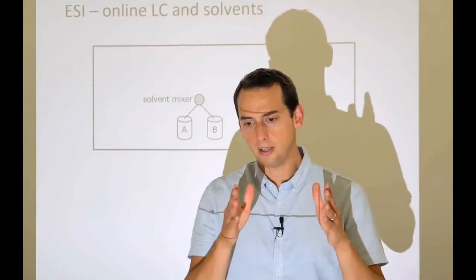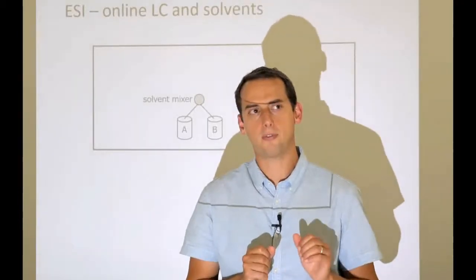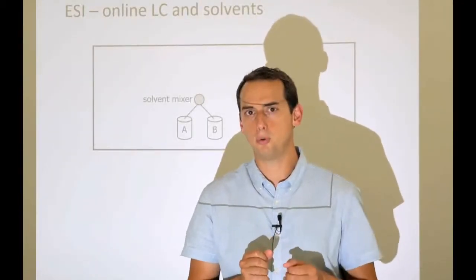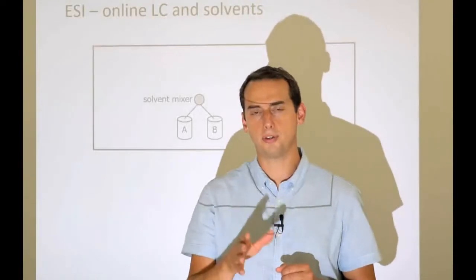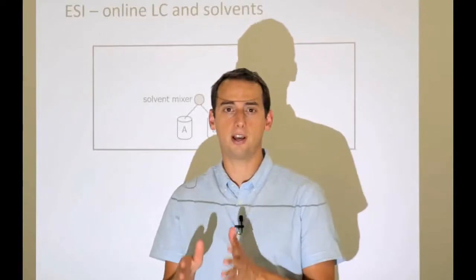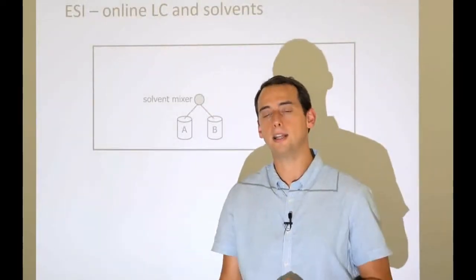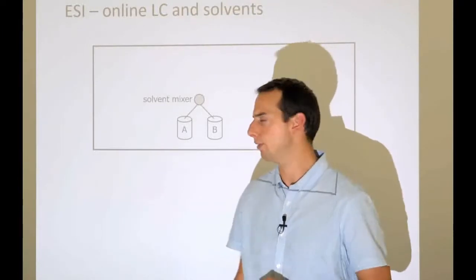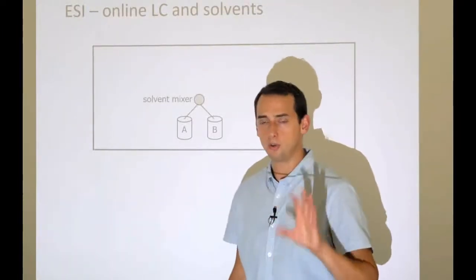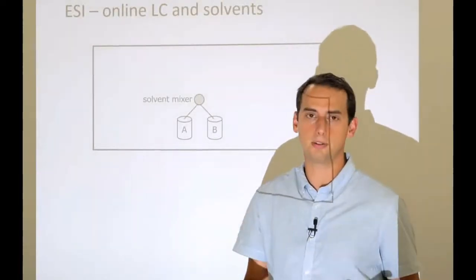If we have these particular peptides cleaved from a protein, and we have 5,000 proteins, and I can give you the number for human genes is roughly 30 peptides per protein, that gives us 5,000 times 30, gives us 150,000 different peptides. That's not counting any modifications that might occur on the peptides, such as shortening them or adding chemical groups to them like phosphate or whatever. Now, this is an enormous amount of peptides, and if you throw this at once at the mass spectrometer, it's simply going to be overwhelmed.